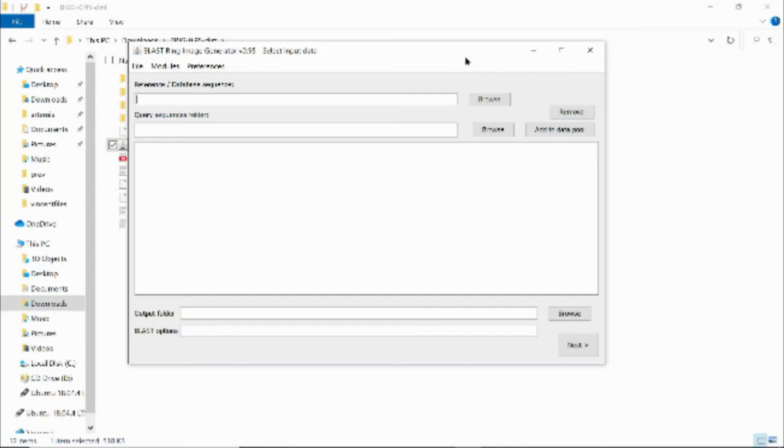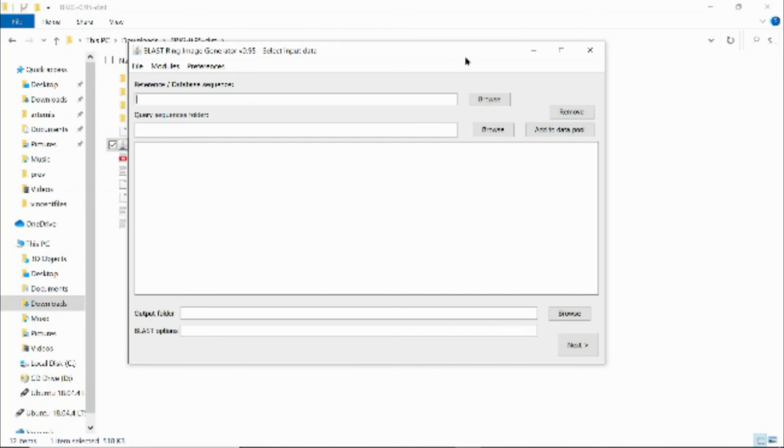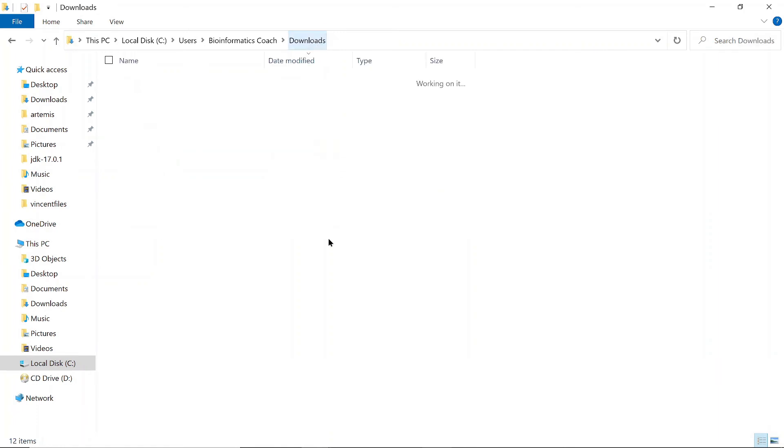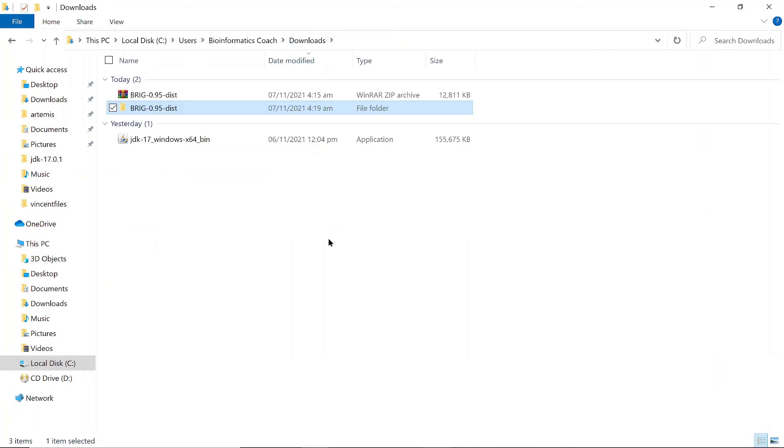From here you can just go and then just browse your reference genome, your query sequences, and all that. But these are things that I've covered, so I have a separate video that shows you how to visualize BRIG. So once you have it set up like this, just go and then watch that video to get started. After you are done, you can just close it and you can also just close your command prompt here, and then you are done.